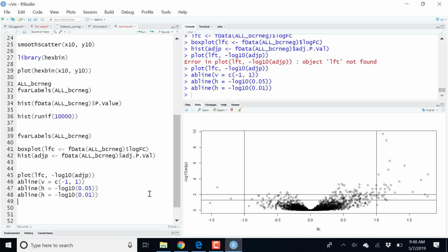So again, it depends how many results you are happy to chase, and that are needed for you to proceed in your scientific investigation. Same thing if negative or downregulation is important: the best candidate would be this one, and then maybe this one. Here, clearly, in terms of reproducibility of the results, this one is not as good. But most likely, anything beyond that one will be more critical, irrespective of the fold changes.